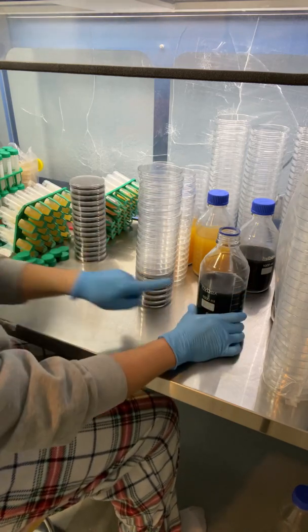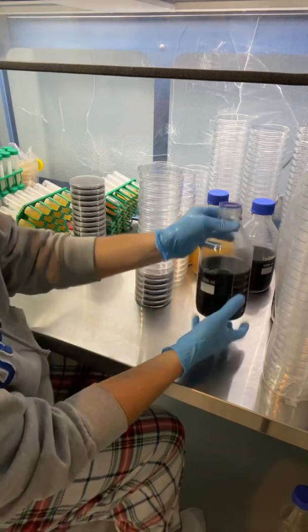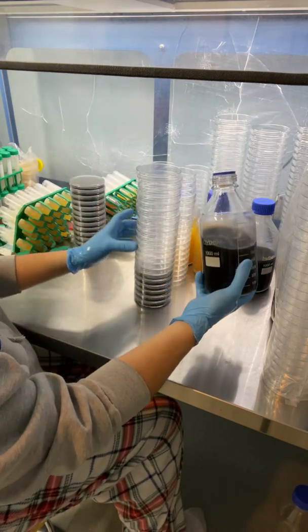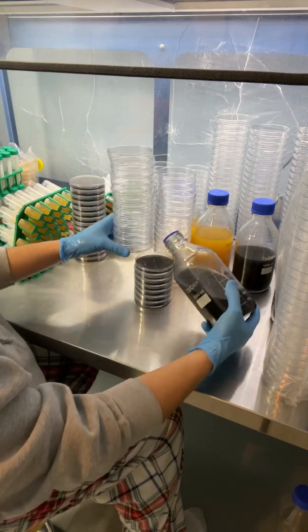It's important to leave some head space in your media bottle so it doesn't explode when you take off your lid like that. And I'm right underneath the airflow here so I'm going to just work my way up.